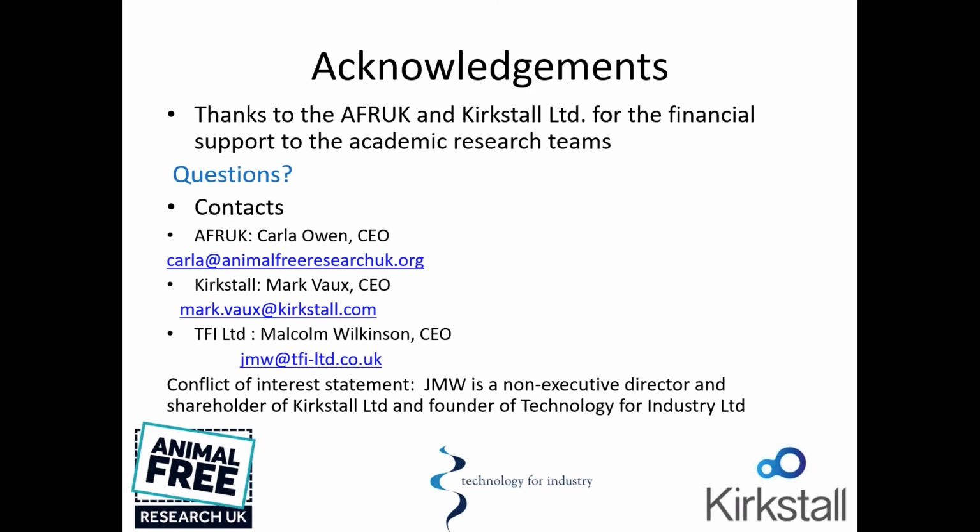Great. Is there a risk of compound binding to the tubing of the system? So this is the Quasi Vivo system. Absolutely, that's a good question, because that's one of the things we found very early on: a lot of labs use PDMS silicones, and a lot of chemicals, whether it's a drug or other materials, bind to these silicones.